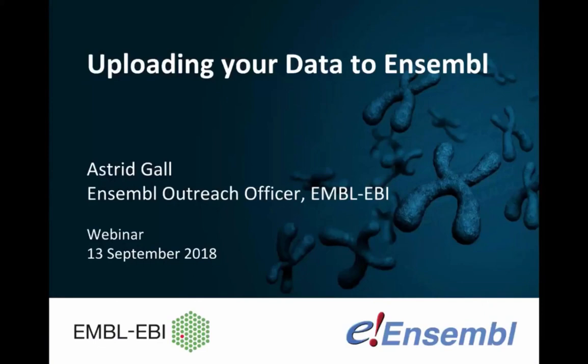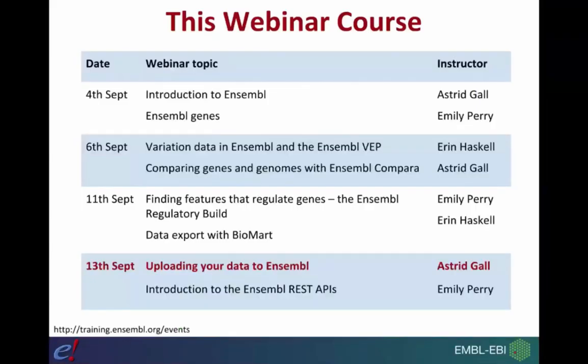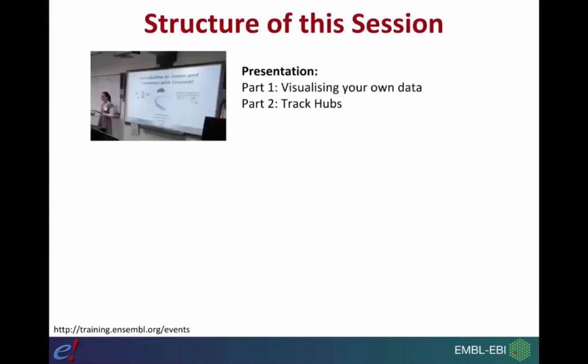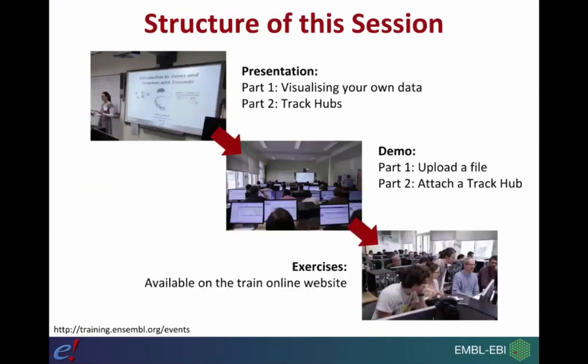So now I'm going to be talking about uploading your data to Ensembl, which is the seventh part of our webinar series, and later Emily will follow on with introducing the Ensembl REST API. This session will be structured in a similar way as previous sessions. We're going to have a presentation which is split into two parts.